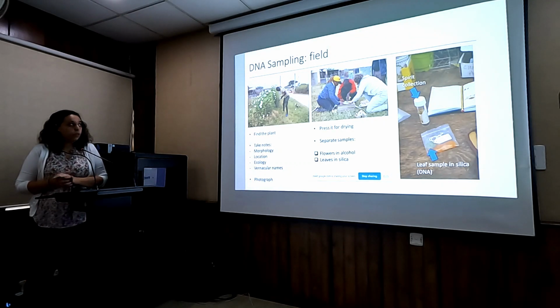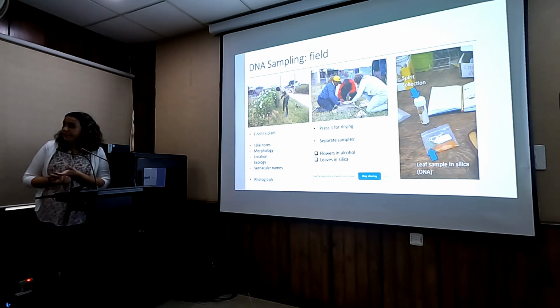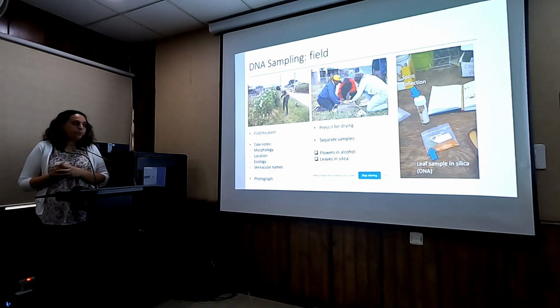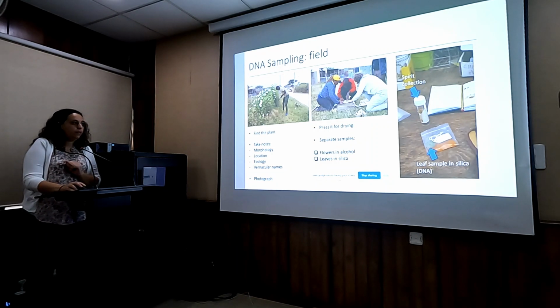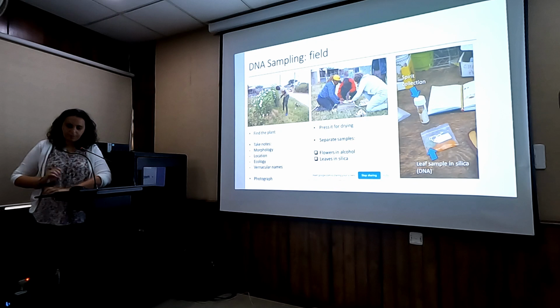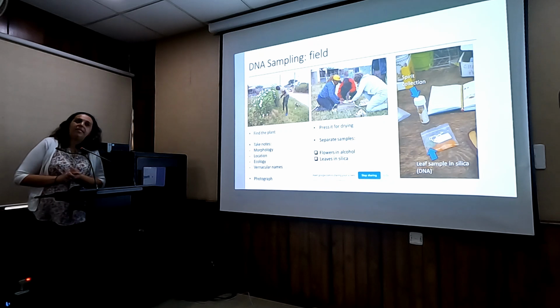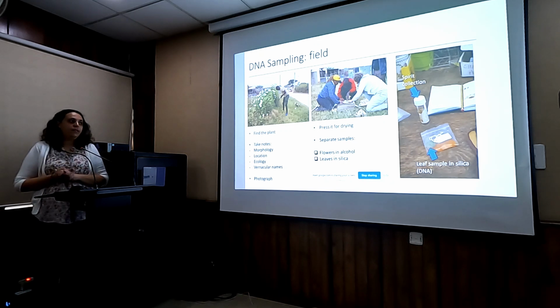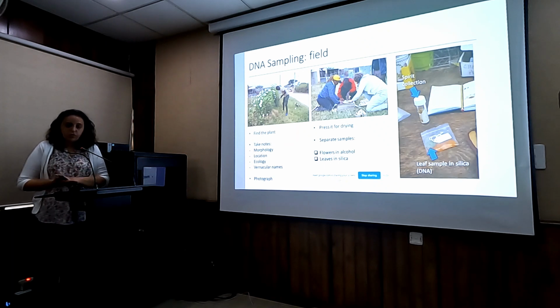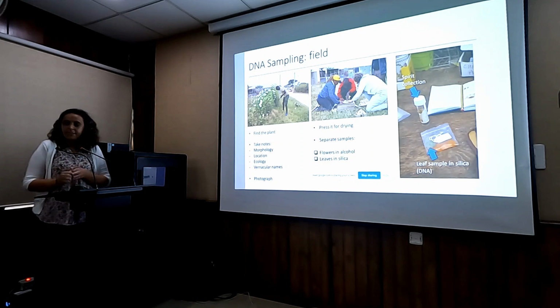So when it comes to DNA sampling from the field, it's very common for people to carry silica when they go to the field, thinking already of collecting DNA samples. So usually carry a little bag with silica and some tags. Just if you want to be prepared, make sure you always keep these separate bags. It's easier to collect the fresh leaf on the spot rather than pressing the specimen and then trying to collect the leaf later. The DNA will be far less degraded if you put it straight away into silica. So people do that along with collecting herbarium collections. You do the same thing at the same time.